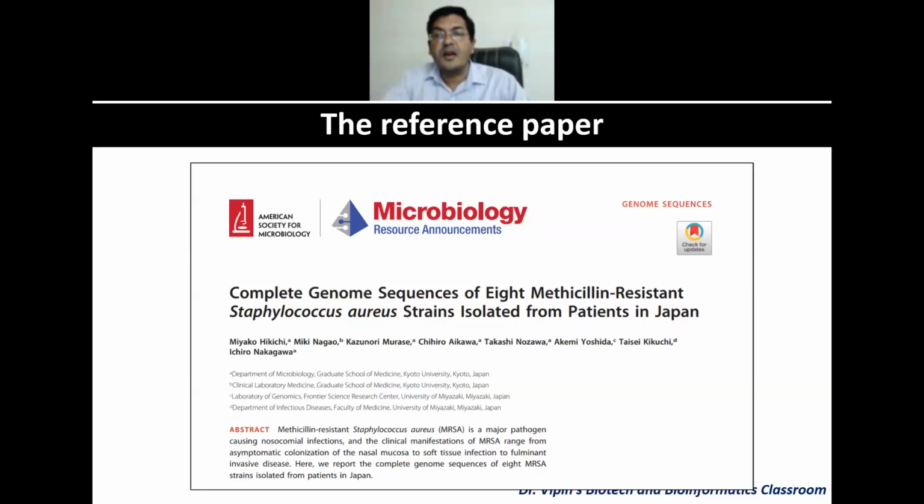These are nanopore data. These have been sequenced using nanopore. Then we're going to go through the data cleansing process, then of course the quality control, and then we move on to assembly. After assembly, we move on to finding whether there are antimicrobial resistance genes in these bacteria or not. And then we're also going to do a bit of annotation using PROKKA. Right? So these are the things that we're going to do today and tomorrow. We'll start today, and then we can continue this tomorrow.